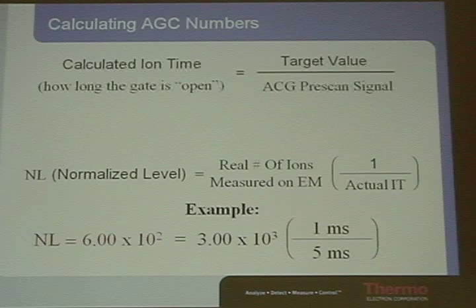Do you have questions? What is the injection time? The injection time is how long the gate is open to fill the trap. And that will change from scan to scan. Every scan will have a slightly different injection time. Intense ions will have what kind of injection times? Short. Very tiny ions will have very long injection times.